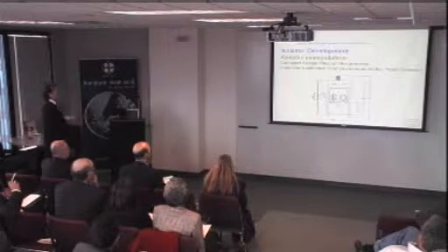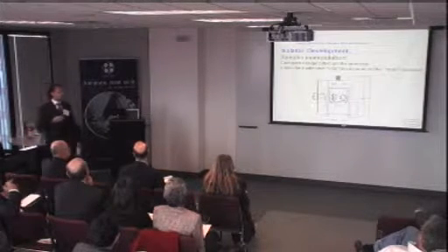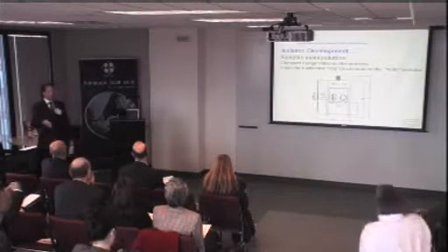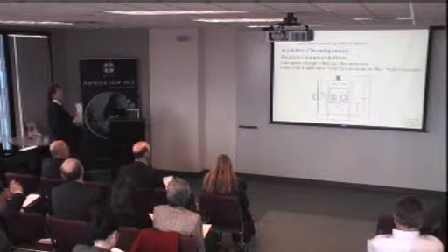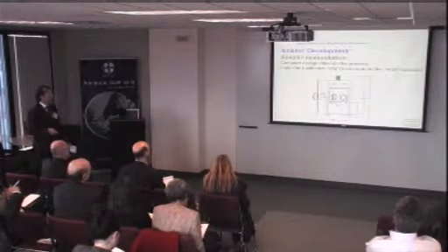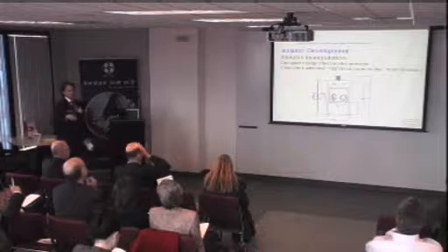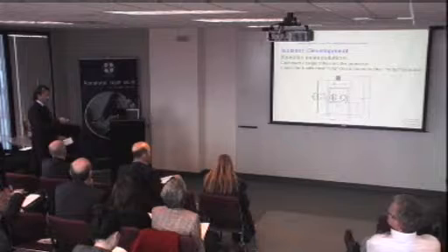That's critical because if the isolator is not well designed and the operator must do mismanipulation, it can happen that damage is generated on the stem cells. So, what we decided to do was to have a mini isolator, a very compact isolator, its length is less than 5 feet, instead of building a big clean room, where the risk of mismanipulation is much higher because you cannot standardize the procedure as well as you can with the isolator.